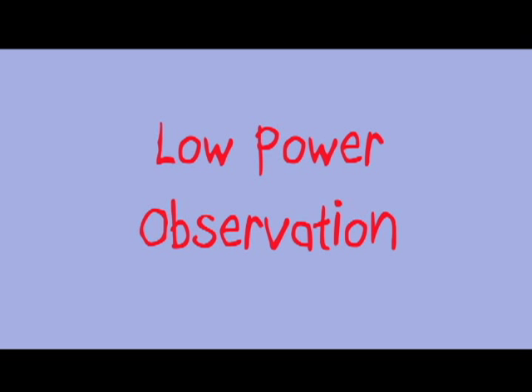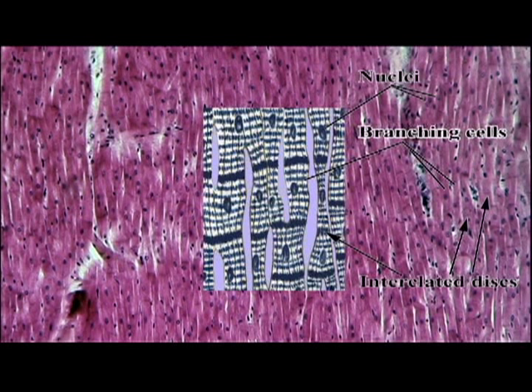Low power observation shows the contractile cells to be short and branched, and at this magnification only a few intercalated discs are observed. As the slide is scanned, notice the similarity of the tissue — the numerous short, striated, branching cells.